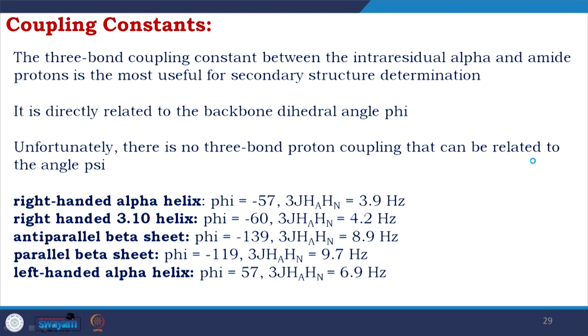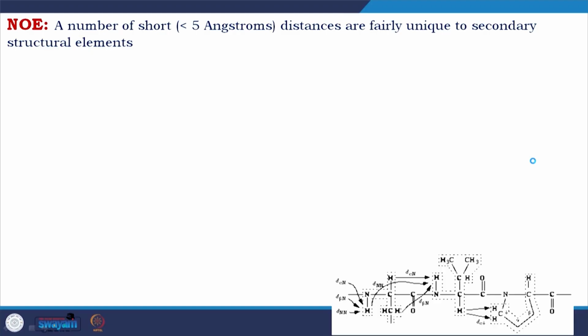So, because we get those fingerprints as we were talking about before, now it is very convenient to determine the secondary structures.